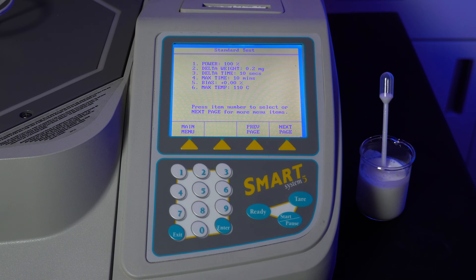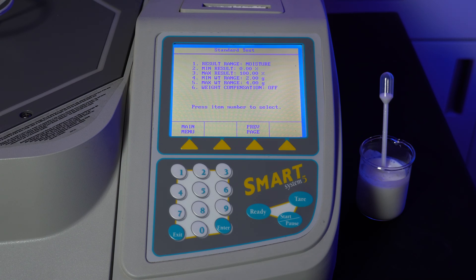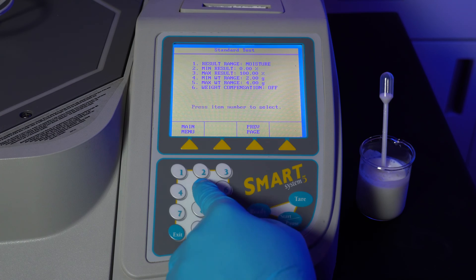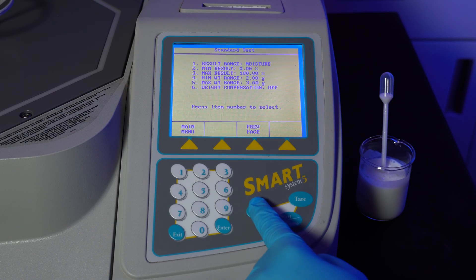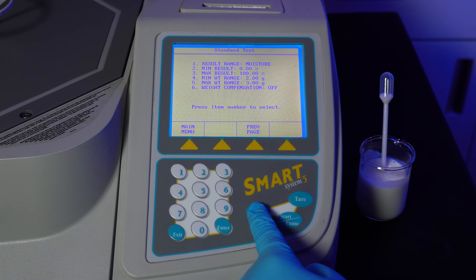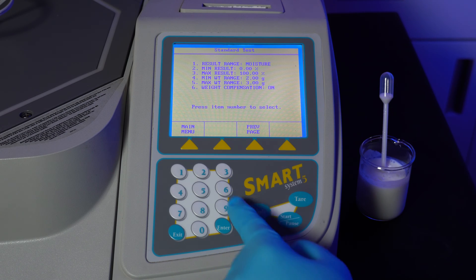Max temperature will be 110 degrees Celsius. Select next page. Result range is what will be displayed — we want to display the moisture content percentage. Minimum results should always be set to 0, max results should be 100%. Minimum weight range will be 2, max weight range will be 3. Weight compensation will be left on as it helps samples with buoyancy effects such as milk, margarine, condiments, etc.